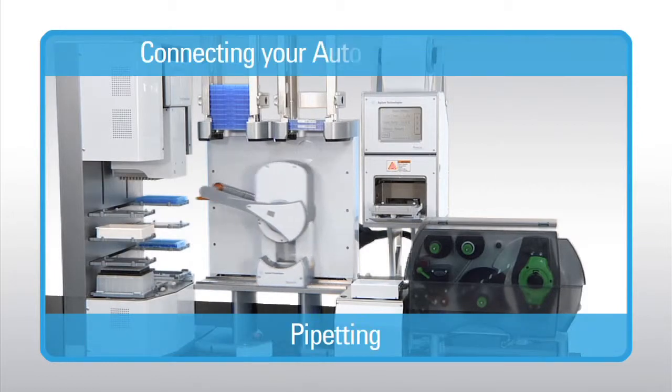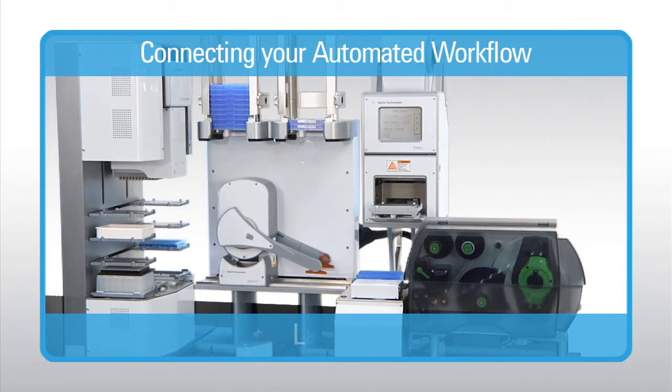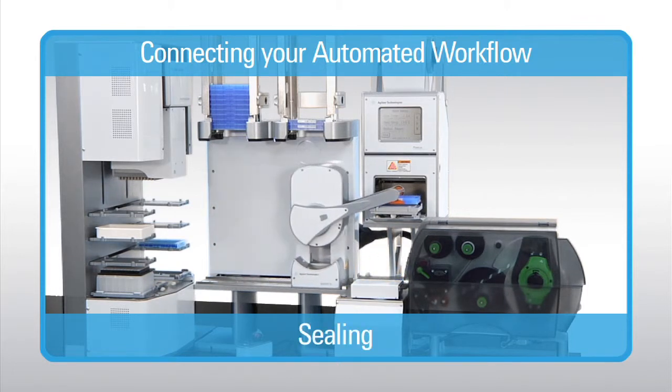The BenchCell is a low-risk, easy first step in lab automation, and it grows with you as your needs and budget allow. From a few dozen microplates to hundreds of microplates and overnight runs, the BenchCell works tirelessly, providing you with precious walk-away time.